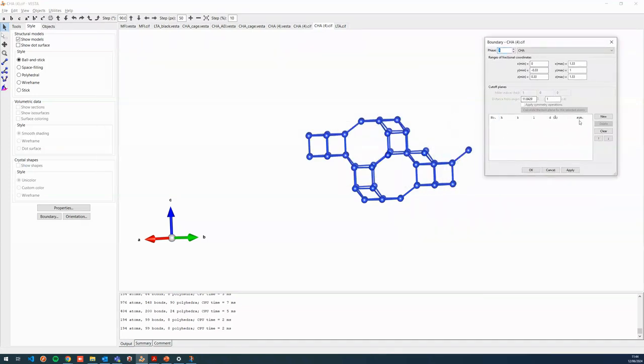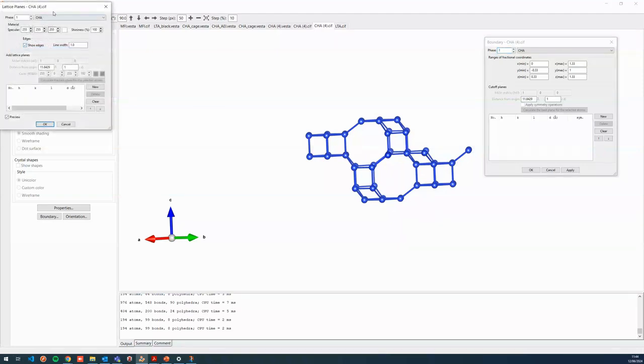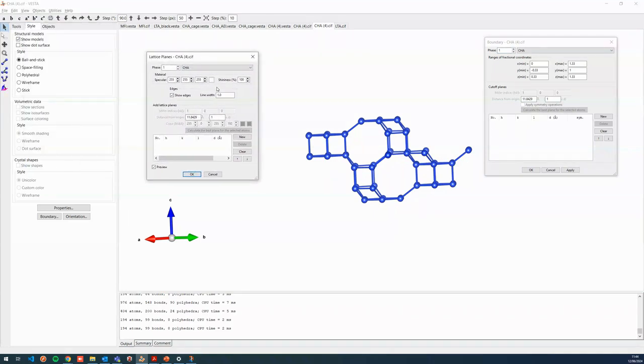The unfortunate thing about this, and I'll put it on the right because you'll see in a second why, is if we use this, you don't really see where the plane is placed. You have to know it based on your knowledge. Now, sometimes you can do this if you have a lot of knowledge about the crystallographical unit. You can play around with this. It's perfectly fine. But I guess most of you also maybe want to do it by trial and error, see how those work.